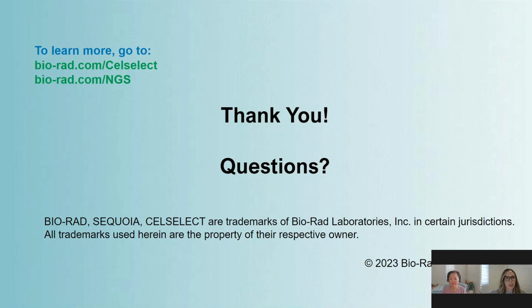What is the purpose of the post-library ribodepletion in the design of your experiment? Great question. Most depletion kits deplete the ribosomal RNA prior to library construction. This strategy carries the risk of losing rare or limited transcripts through sample handling or RNA degradation.